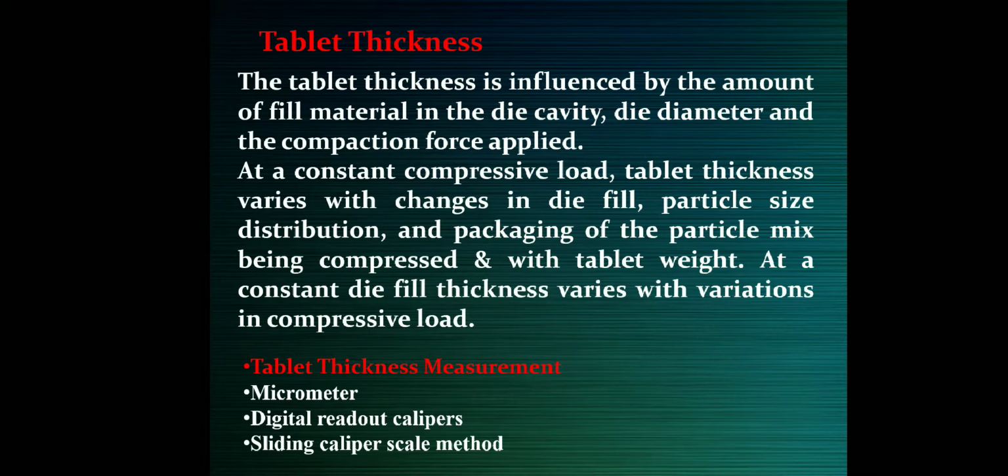Tablet thickness. Tablet thickness is influenced by the amount of fill material in the die cavity, die diameter and compaction force applied. These three parameters or factors, that is die cavity, die diameter and compression force, play an important role in determining tablet thickness.